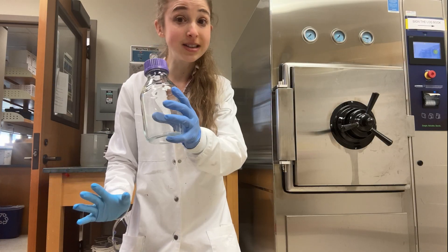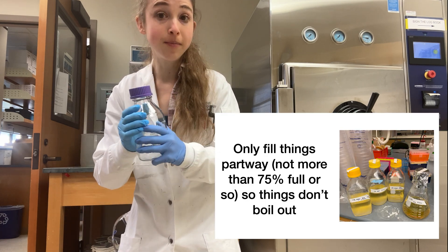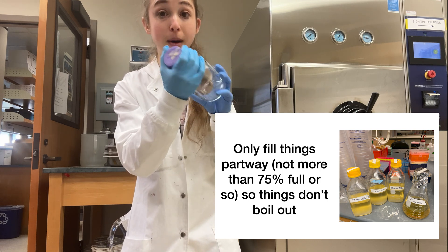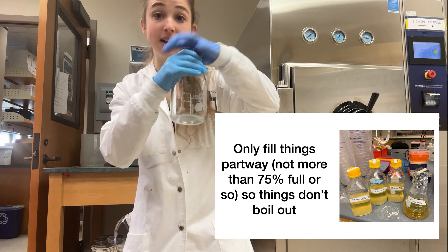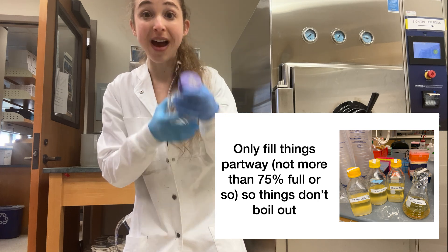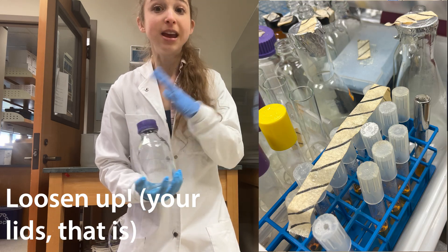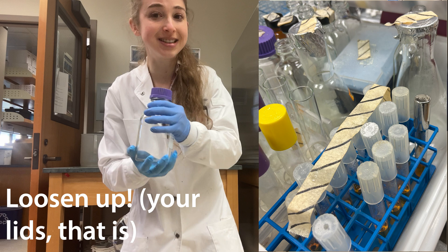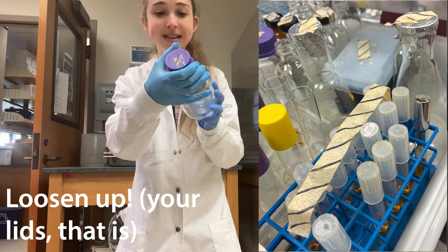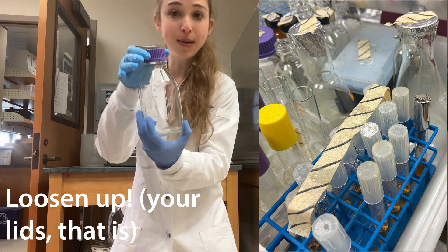Speaking of liquids, when you have liquid it's really important that you don't fill it more than about three-quarters full. And whether you have liquids or solids, it's really important that you don't have the bottles tightly capped. What's going to happen is there's high pressure outside and lower pressure inside, and you're basically going to get a vacuum seal form that will be really, really hard to get the caps off. What I like to do is put the lid on and then do a single quarter turn, just keep it a little loose.